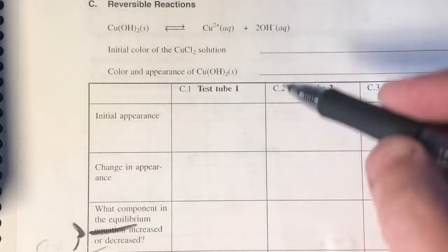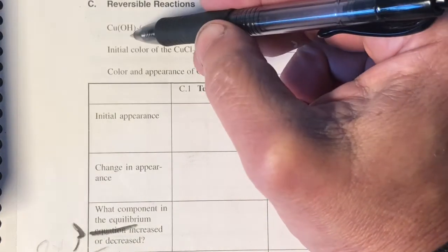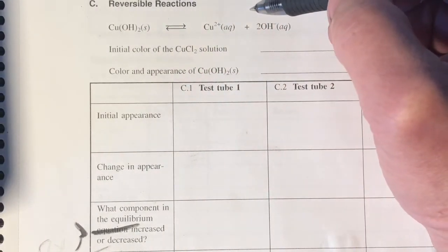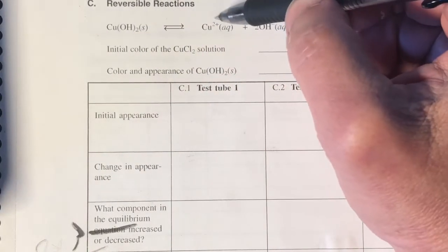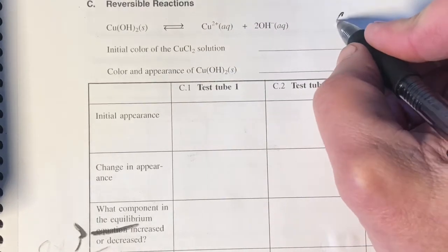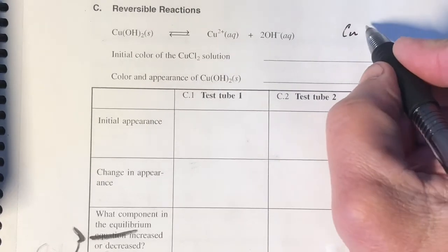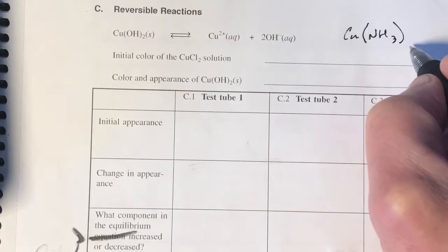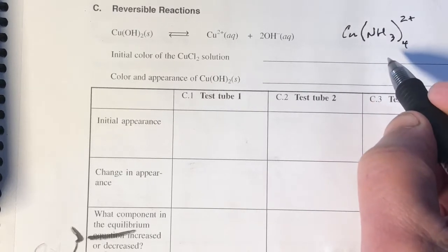And so what that tells us is that in number 1, we pushed the reaction to the left, forming copper hydroxide. In number 2, we pulled the reaction to the right, forming less of the copper hydroxide. The copper here doesn't exist as copper 2 anymore. When we have the ammonia, we actually have this complex of copper ion having, turns out there's 4, but 4 ammonias around it.